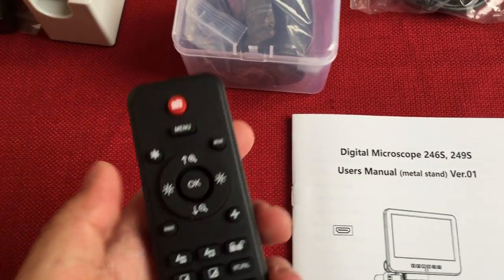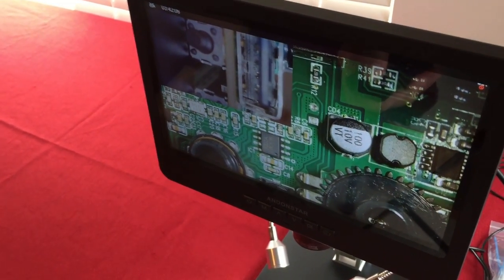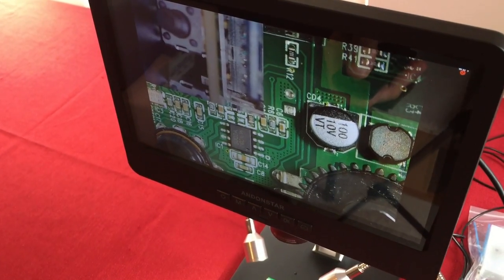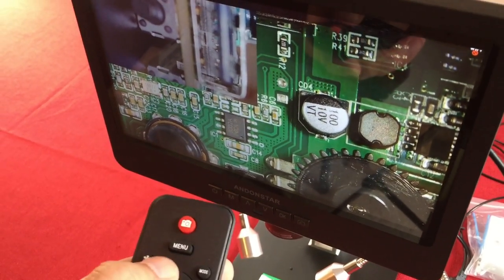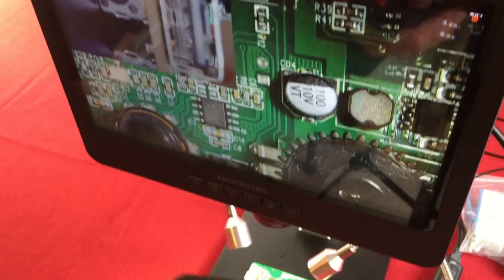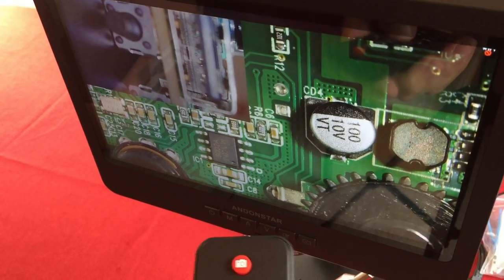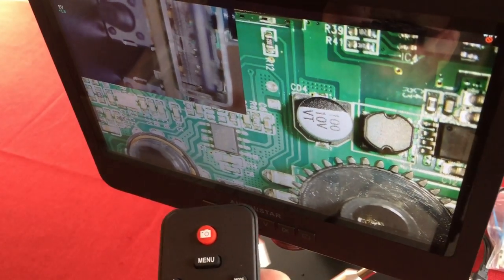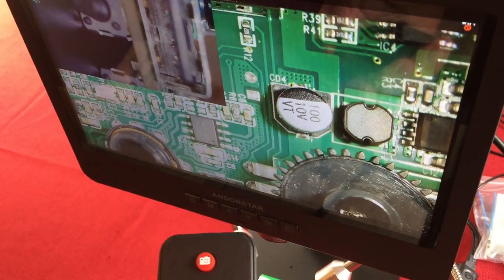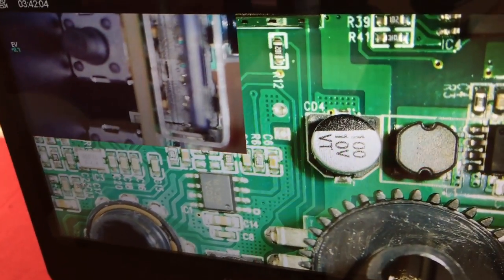The remote control is cool — it lets you take pictures by hitting the red button from a distance. It also has a freeze function to freeze the image while you're working, a menu button, a mode button, zoom up to three times digital zoom, and brightness control for the lights. There's also a crosshair feature to add red grid lines, which you can adjust for width, vertical, and horizontal, great for design work.